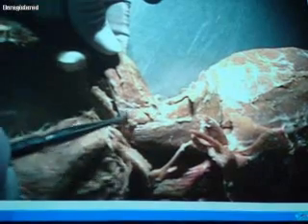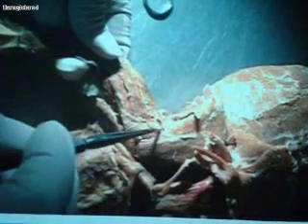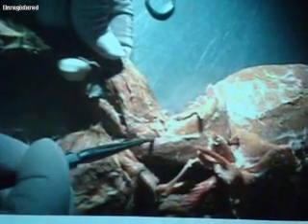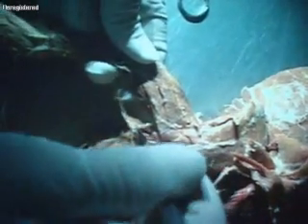These three muscles spell SAC. The first is spinodeltoid. The next, a kind of triangular-shaped muscle, is the acromiodeltoid. And then the muscle sitting right on top is the clavodeltoid — you can call it either clavodeltoid or clidodeltoid. It's this muscle right here.